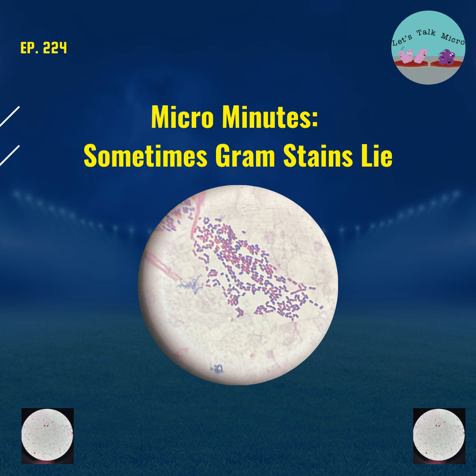Your Gram negatives have a thin peptidoglycan layer and then the outer membrane. Ultimately, what they retain is your counterstain, the safranin, and they stay pink. So your Gram positives retain the crystal violet and stain purple, and your Gram negatives retain the safranin, which is pink.